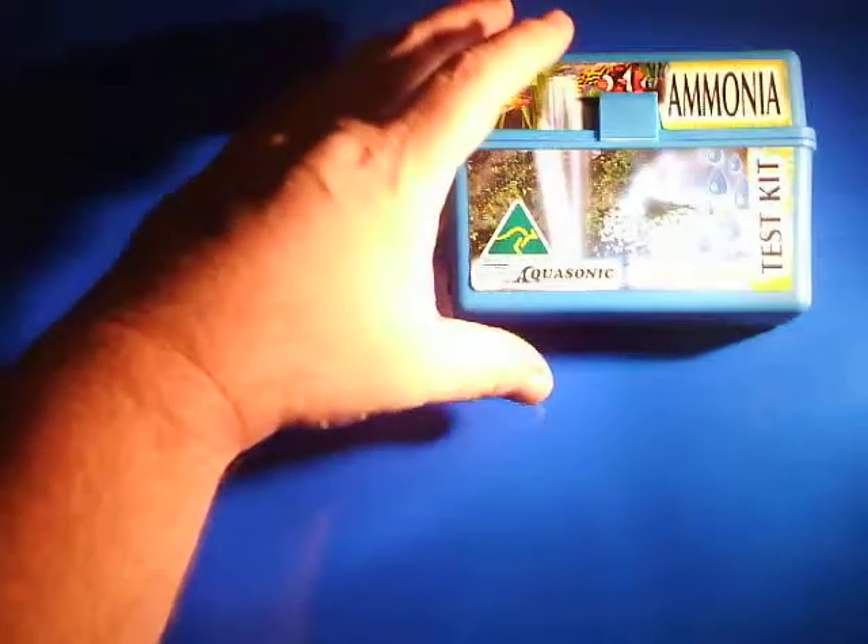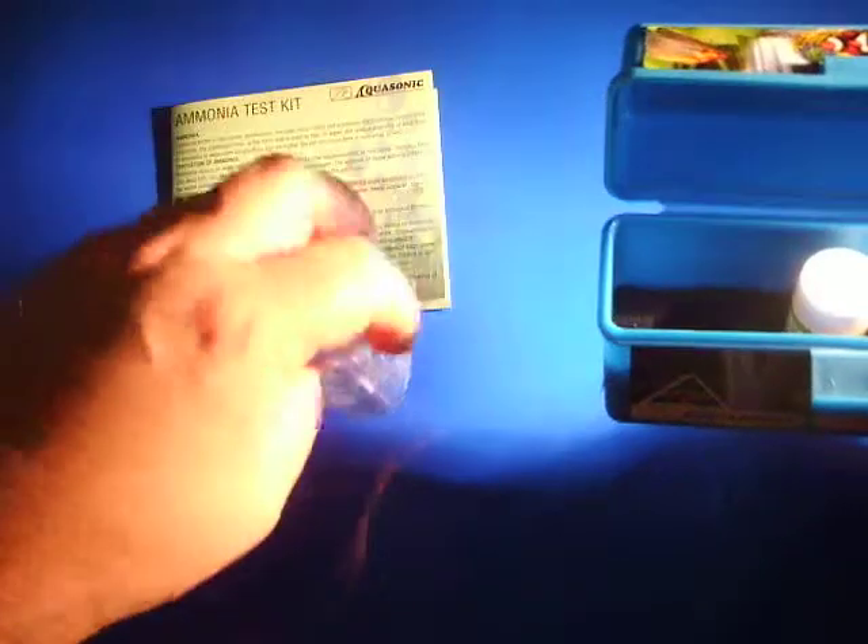Here we have the Aquasonics ammonia test kit. When you get it, it comes in a nice sturdy plastic container. When you open it up, you have the instruction manual, the test kit for putting in the water with the reagents, and the reagents that fit all nice and neat in the container. It's got a foam insert so it makes it nice and easy for them to sit in there.